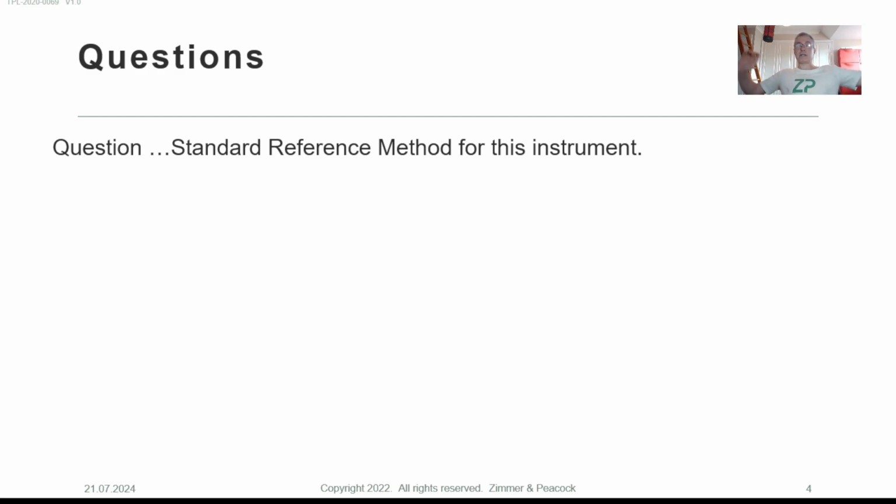Now the question this week is coming in from a potential reseller slash distributor. Probably reseller, and they want to know what the standard method is that we use for validating the FoodSense Generation 4. I suppose I haven't even mentioned the FoodSense Generation 4 even once here.